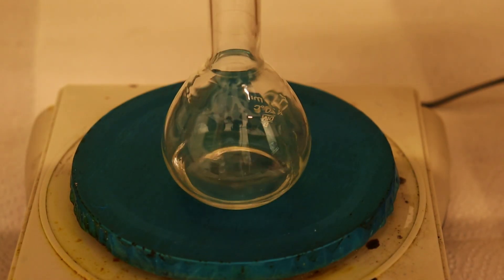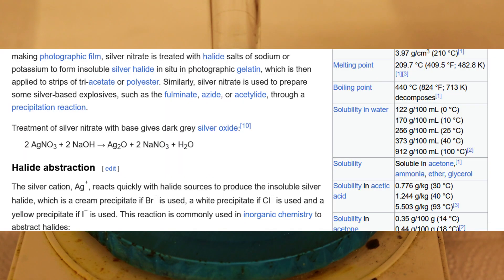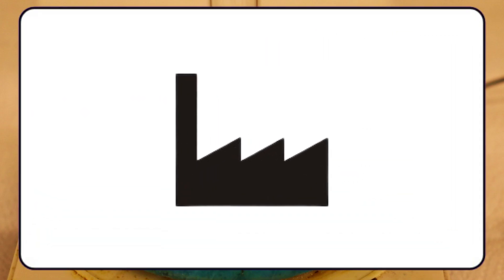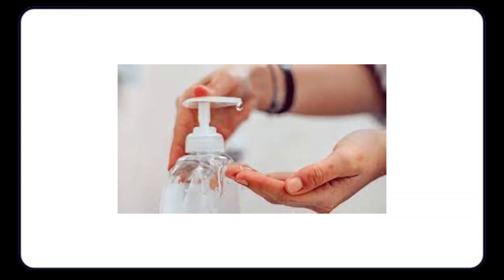Like many other salts, silver nitrate is also a generic white crystalline solid that dissolves very well in water. It has many uses in chemistry, industry, and medicine. It's used as an antiseptic and for treating some kinds of disease.